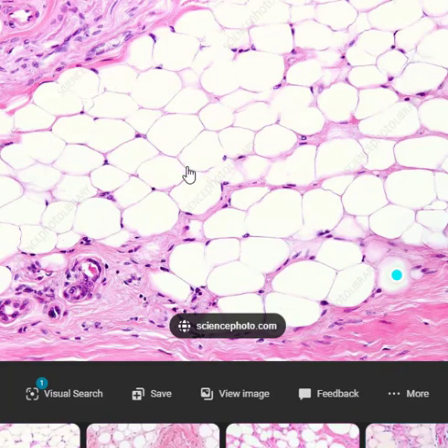Here's a picture with a little bit more staining. So you notice you're seeing other kinds of cells over here, but these stand out. The fat cells are unmistakable. They're one of the easiest cells to find because they literally look like white cotton balls. And there's the little teeny tiny nucleus right there. Here's the nucleus right there, squished over to the side.